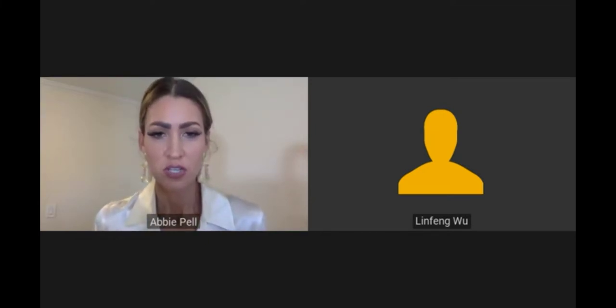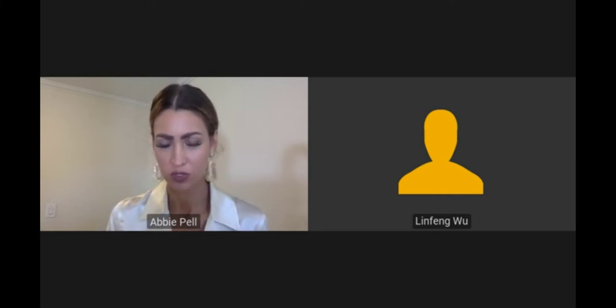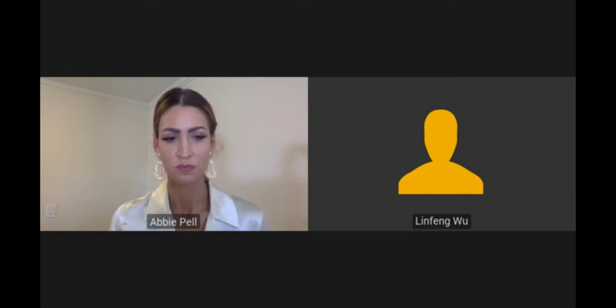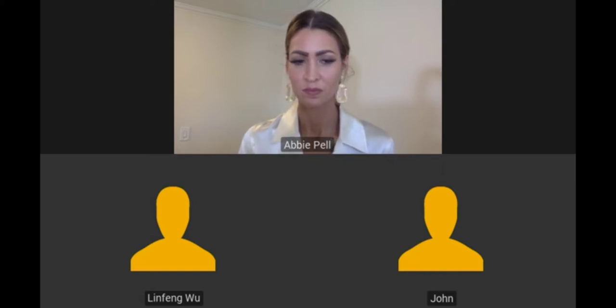Our third question is, after loading samples on Evotips, will the tips dry out? This is a good question. After sample loading, I add some solvent A in the tip box so that the top of the tip is soaked in solvent A. This can prevent Evotips from drying out during long-term storage, and also during the data acquisition.